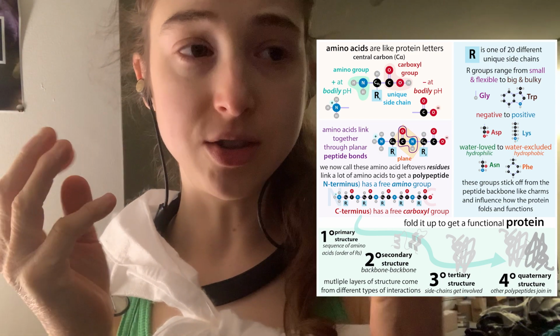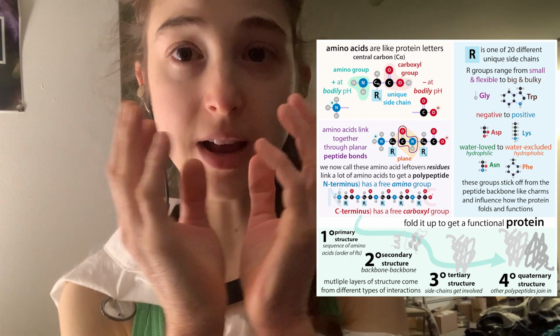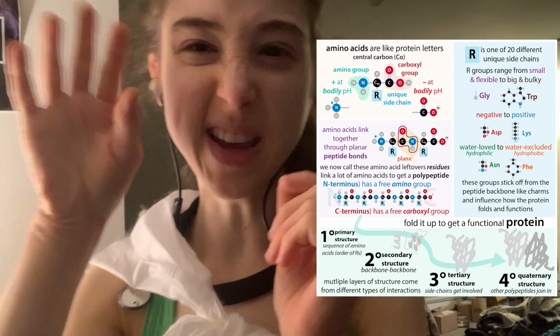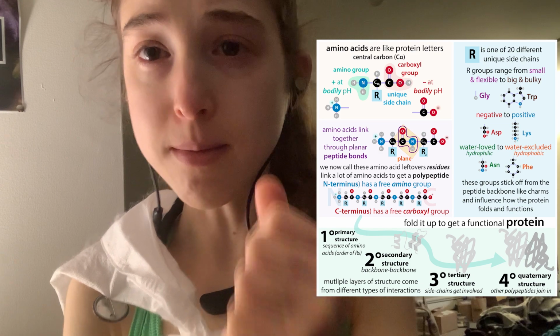Whereas with low resolution data, we kind of just have to guess where those amino acids are, and a lot of times we can only see the backbone, so we can't really see and model the side chains very well. Sometimes we can't even see a region, and so we have to leave it out of our model.